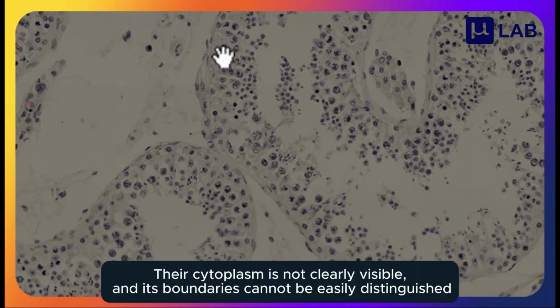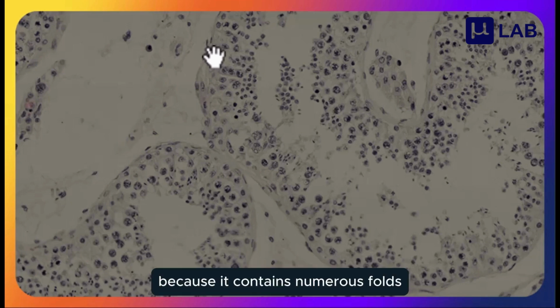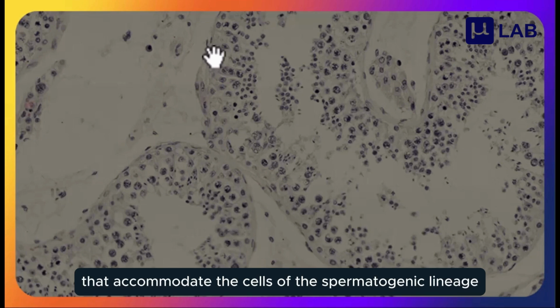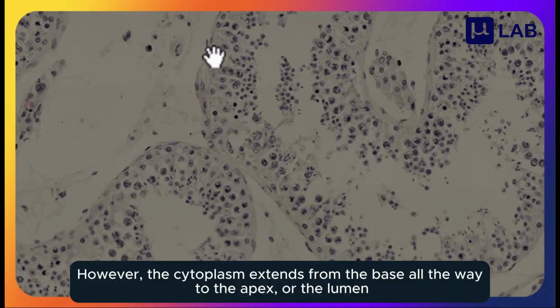Their cytoplasm is not clearly visible, and its boundaries cannot be easily distinguished because it contains numerous folds that accommodate the cells of the spermatogenic lineage. For this reason, we cannot easily observe the cytoplasm. However, the cytoplasm extends from the base all the way to the apex, or the lumen.